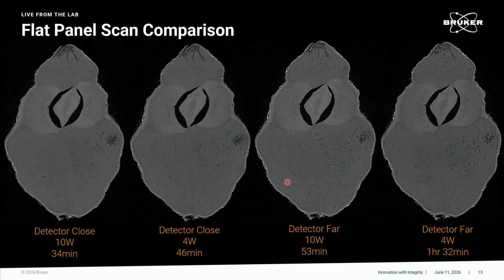So we're seeing an increase from left to right in quality of scan. But the fact of the matter is, all four scans look really good. My guess is, at first glance, you're saying these all look exactly the same. You probably don't really see much difference.